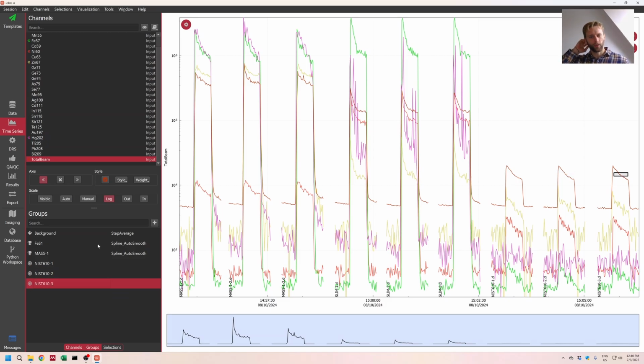This is a little bit of a funny session because it's so short. Generally, you'll have a lot more analyses and you'll have multiple blocks of standards. If you're putting in your samples by hand, like we're doing here, and you're not using an automated way, you'll need to do it this way. You'll have to click for each sample that you're making a little box on the peak of. You'll need to click Add New Selection Group here, if that's the plus.